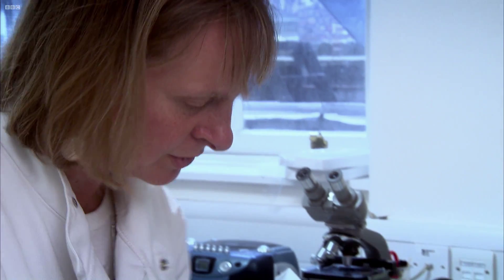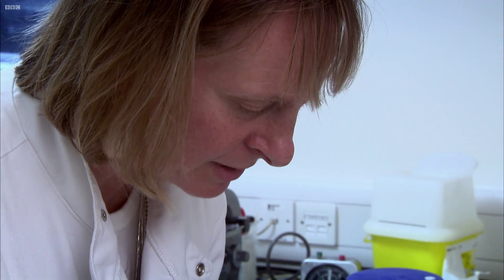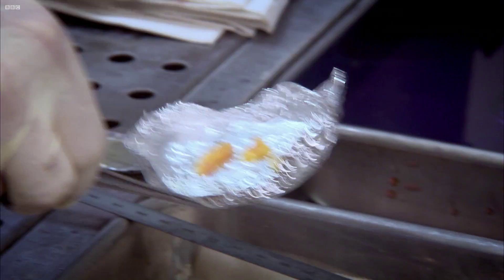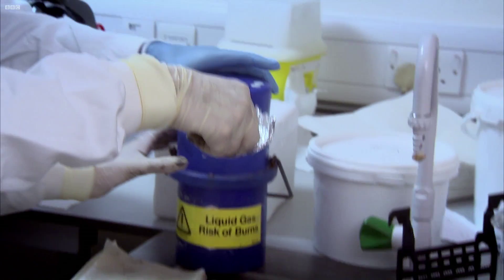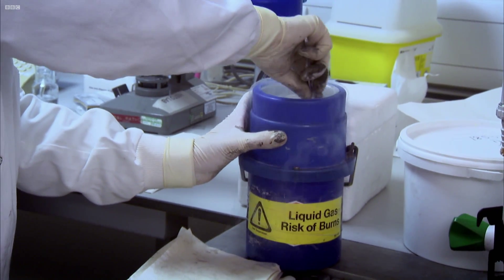The pieces are placed onto ordinary foil, which allows multiple pieces to be frozen simultaneously. They're then immersed into liquid nitrogen, which is super cold, so the tissue is instantly frozen.